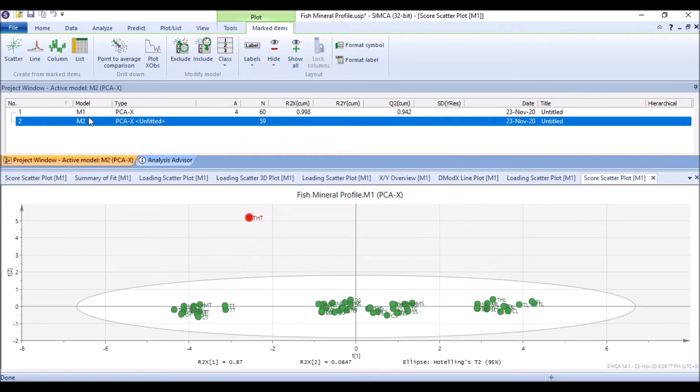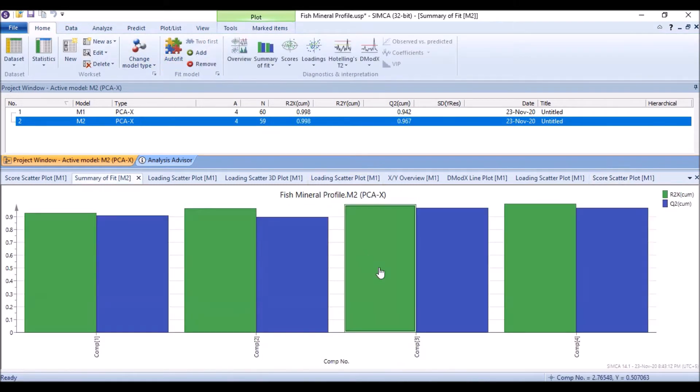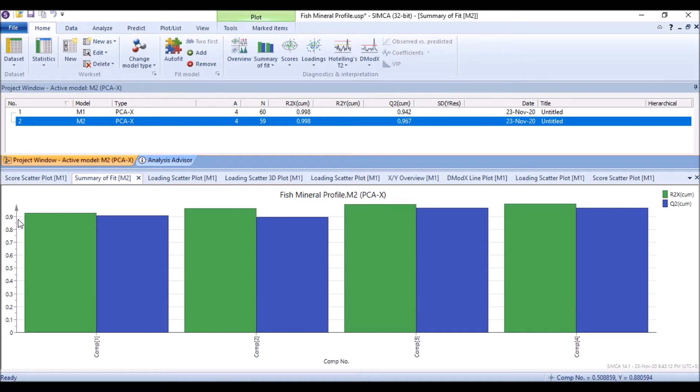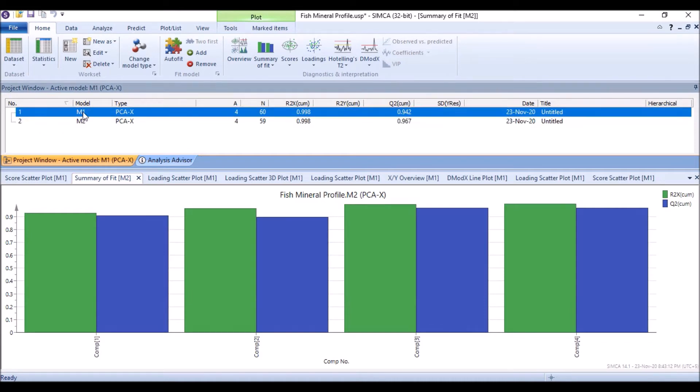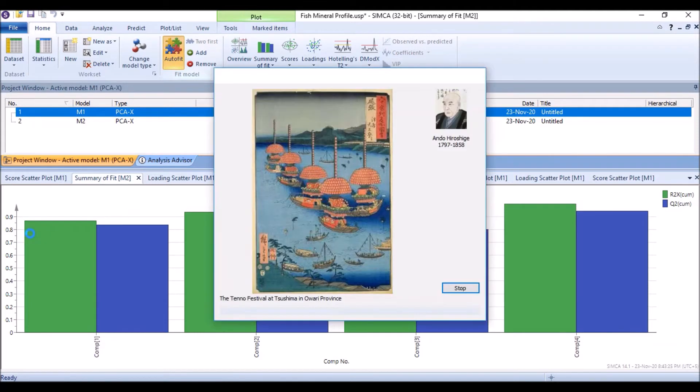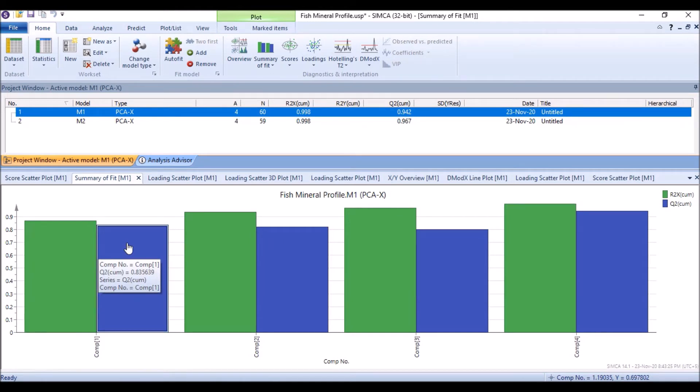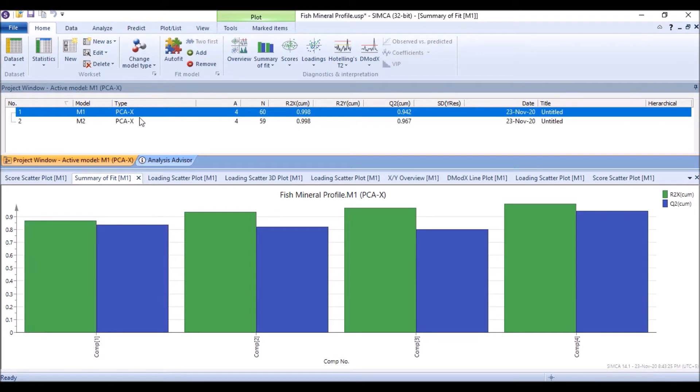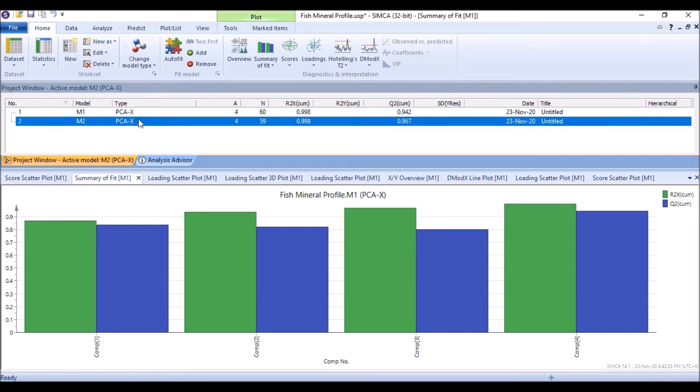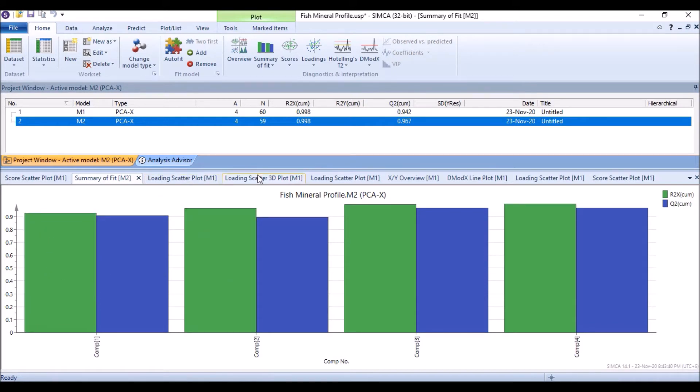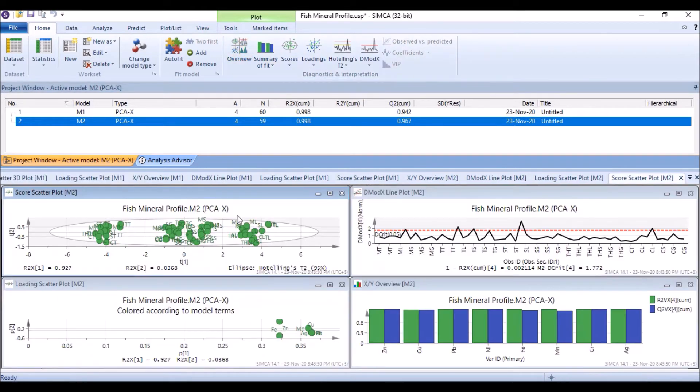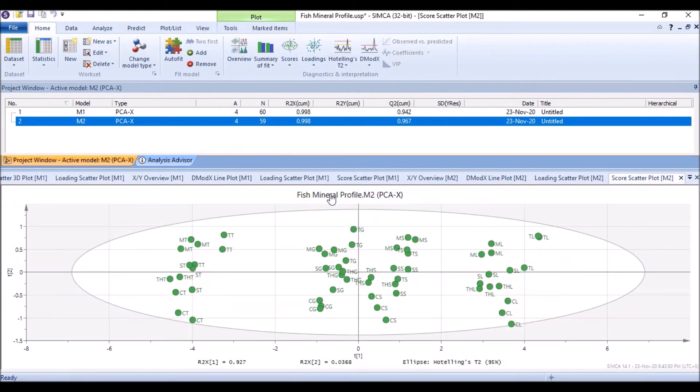As it is a second model we need to auto fit again. And when I auto fit it, I see that the summary of it is 0.9, and the summary of fit in the previous model was less than this. In the summary, the R2X value was 87 percent, while in the second model where we removed the outlier, it is 92 percent.